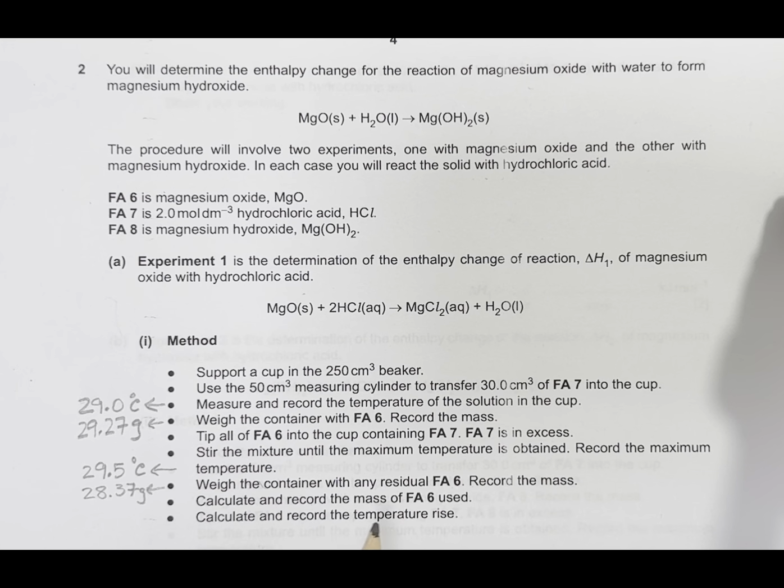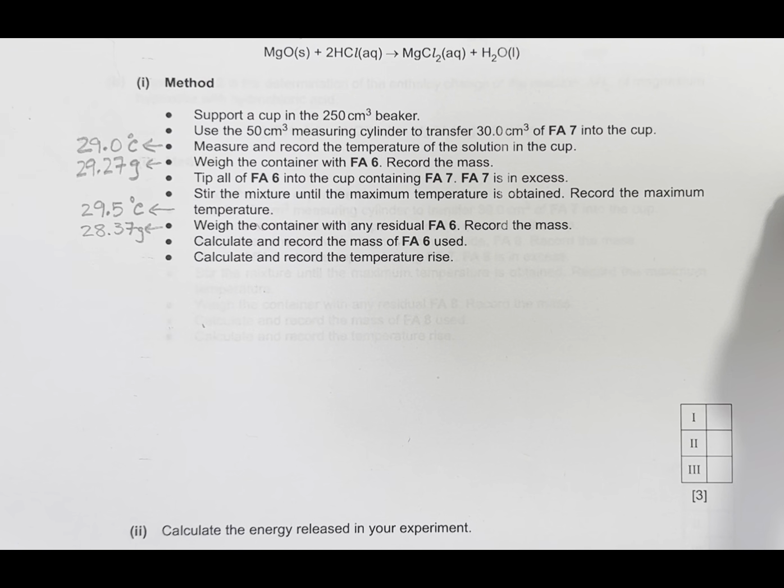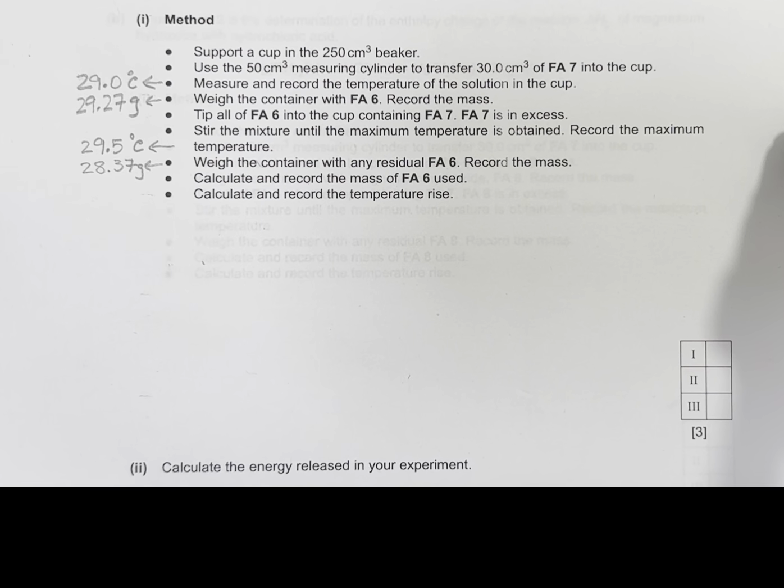Calculate and record the temperature rise, which can also be calculated by subtracting the two temperature values. All of this is to be recorded in a proper table in the space provided. So I have recorded all the observations in the form of a comprehensive table here.